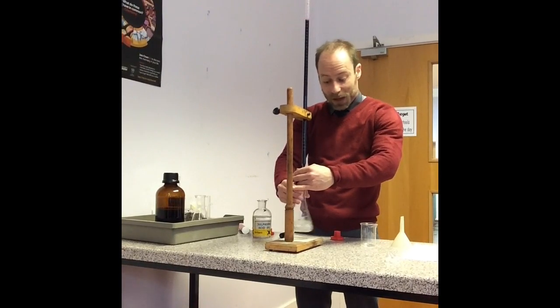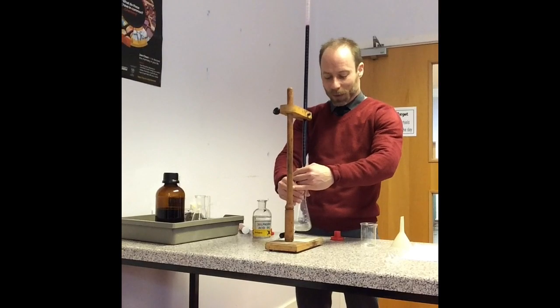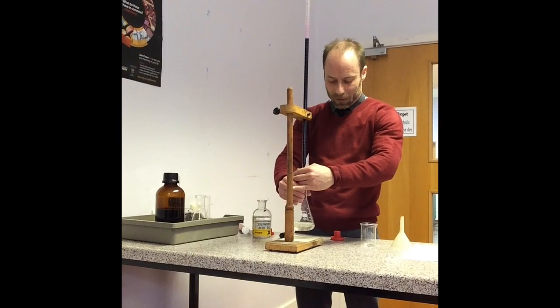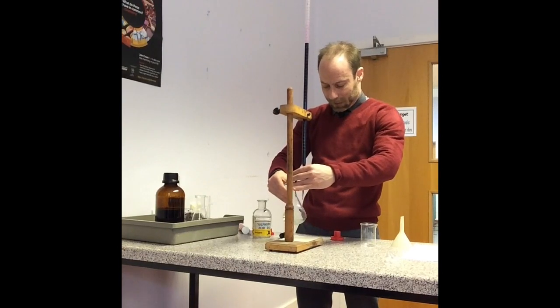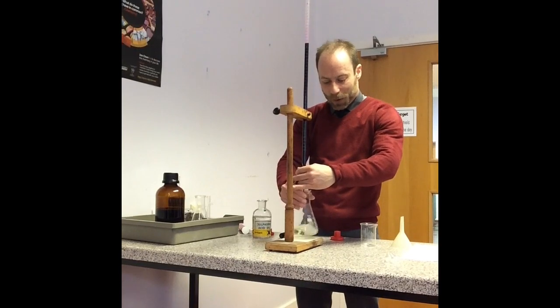I've got absolutely no idea how much it is, because I haven't done it for quite a while. But we do a rough one. It'd probably be about 25 or so. Just going to get that bit at the top. But it's quite nice how the purple colour disappears, isn't it?